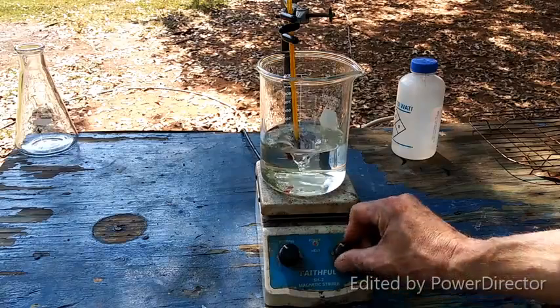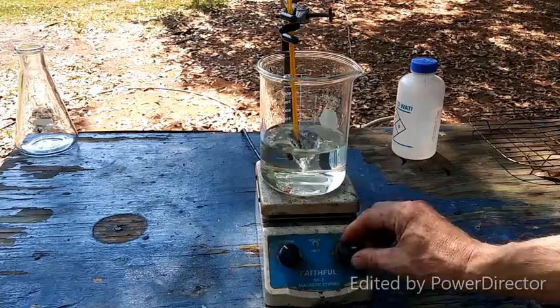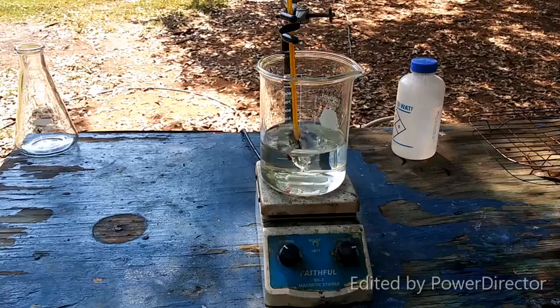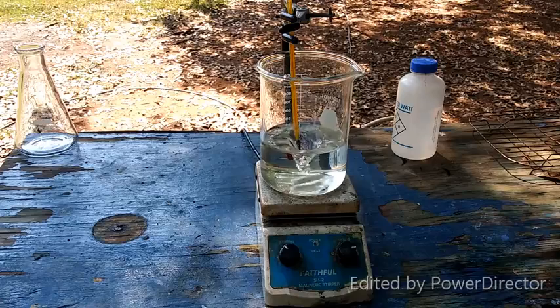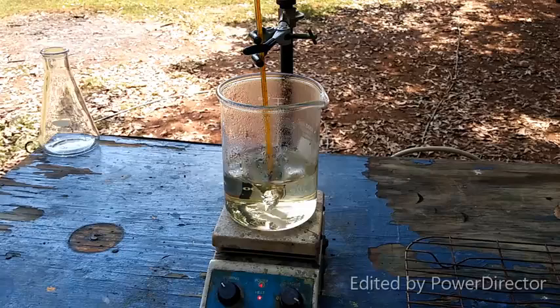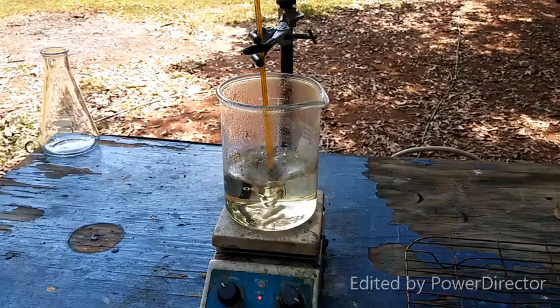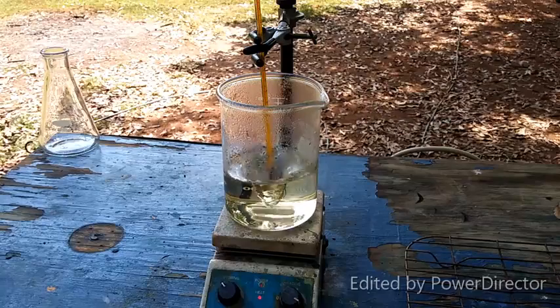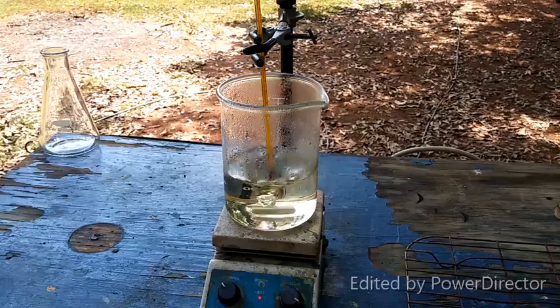So I'm going to go ahead and turn on the heat, and we'll just let it keep going here. And once it hits 80 degrees Celsius, we will turn off the heat and allow it to cool back down to room temperature before we go on to the next step. Alright, so our reaction mixture has hit 80 degrees Celsius here. You can see it's turned ever so slightly yellow. Now, I'm going to take it off the heat.